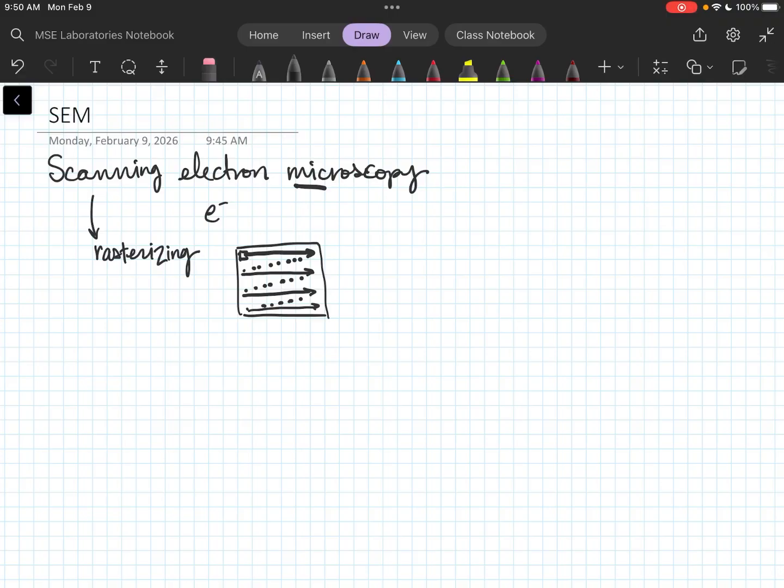And this is actually how an electron microscope scans the surface of our sample. It looks at a specific area on a material, and we start at the top left of our section, scan left to right, and then jump back to the left. It's happening so fast that we don't notice that back and forth movement with our eyes.